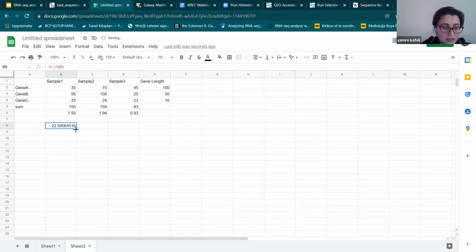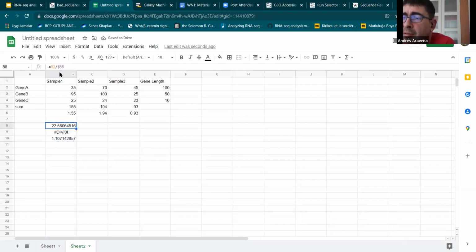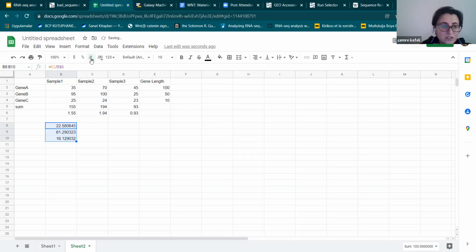And then you need to put a dollar sign before the 6. Yes, we have it. We do this to make the numbers better.